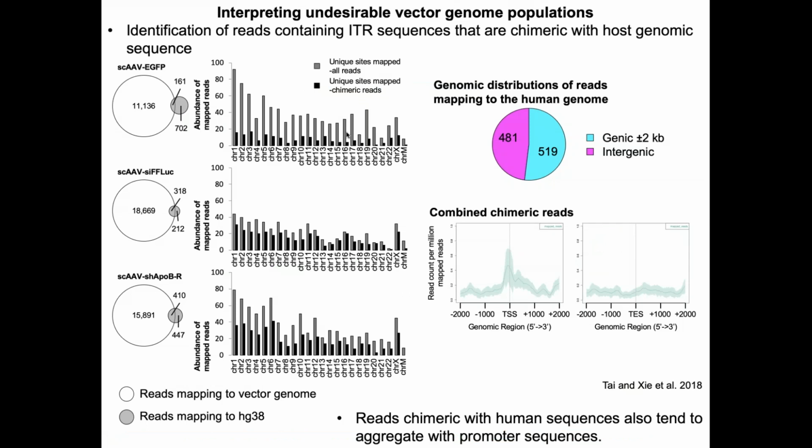The other thing that we were able to, of course, identify and characterize are these contaminating genomes. What I'm showing you here in these histograms is the accumulation of these contaminating reads across the human genome for 3 different preps. And right away we see that there isn't really any enrichment in specific chromosomes that have these contaminating sequences.